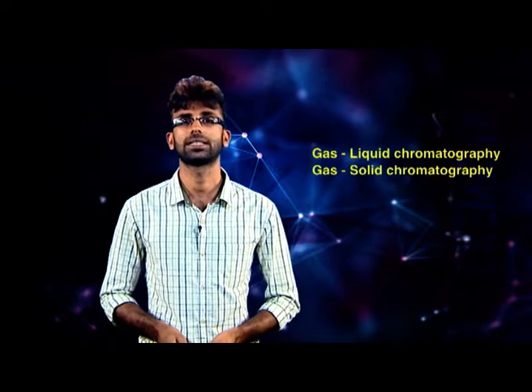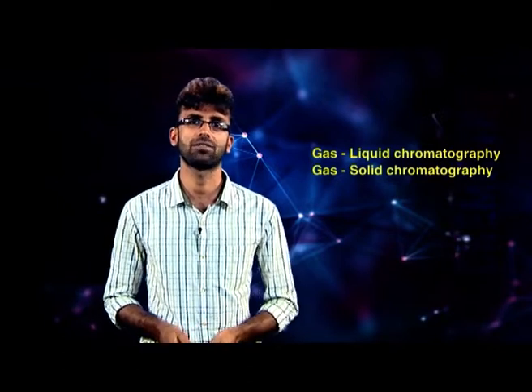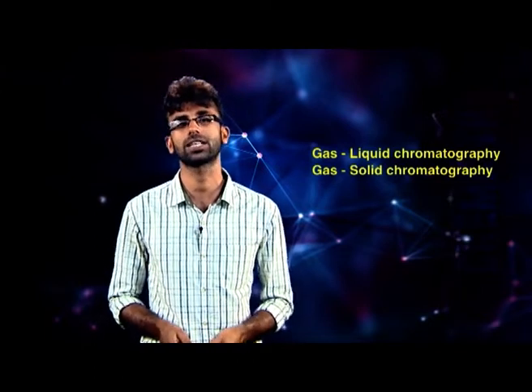Good morning. In this section, I will be discussing the two most commonly used chromatographic methods in research and analytical laboratories. The first is gas chromatography. As we discussed during the classification based on the mobile phase and stationary phase, there are two types of gas chromatography. One is gas liquid chromatography, and the other is gas solid chromatography. The more important one at the application level is gas liquid chromatography. Therefore, GLC is simply referred to as gas chromatography.